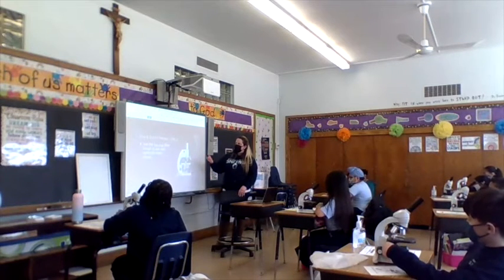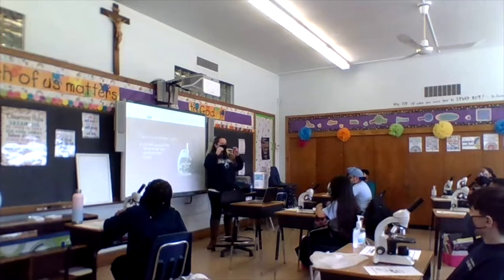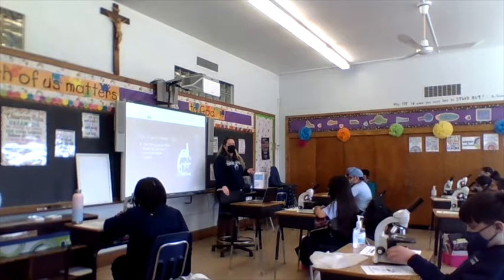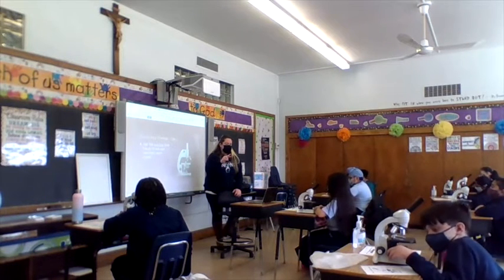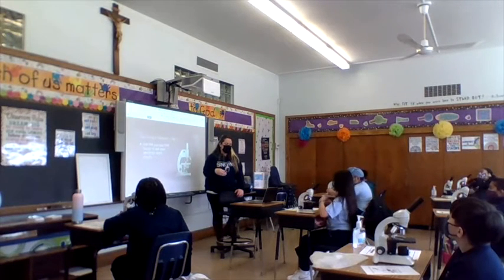Then we use the fine focus, like Ziomara said, and it's the smaller knob. It's just to really focus in on the specimen more clearly. My friends at home, if you have the virtual one, you will notice the two knobs, and then it should zoom in for you, and you'll see the difference when we get into that, okay?